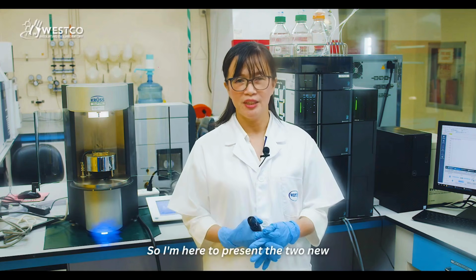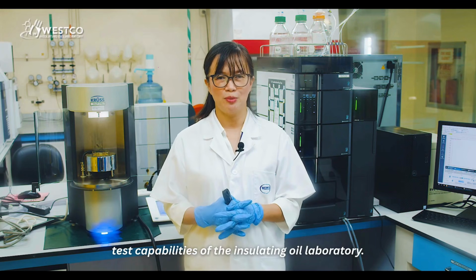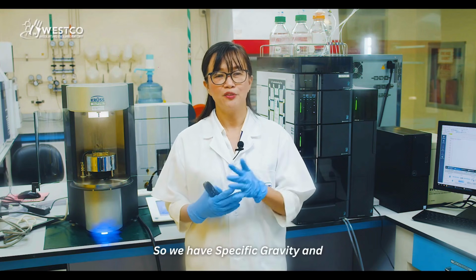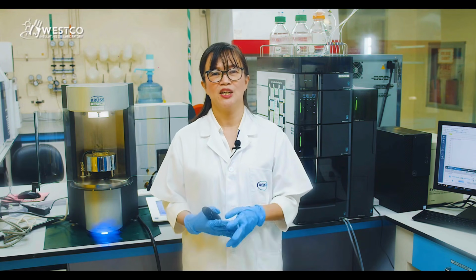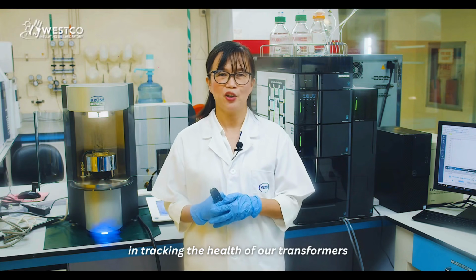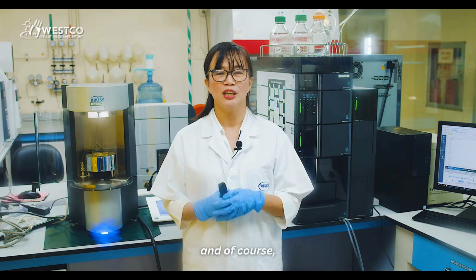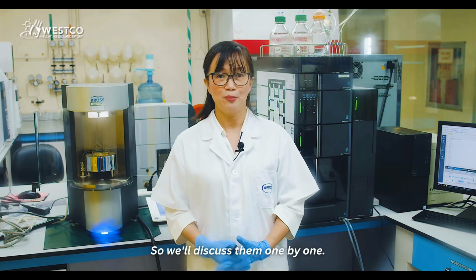So I'm here to present the two new test capabilities of the Insulating Oil Laboratory. We have specific gravity and oxidation inhibitor tests. These two are of utmost importance in tracking the health of our transformers and, of course, to prevent any transformer issues. So we'll discuss them one by one.